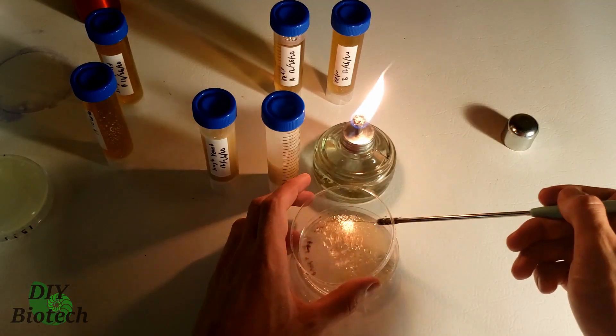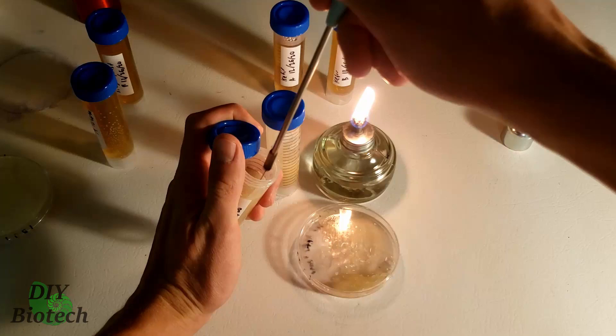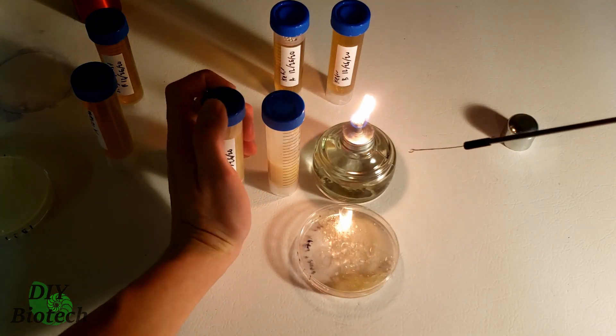Now that I had the isolated yeast, I concocted a mixture of sugar, flour, and water and touched one of the yeast colonies into it to inoculate the mixture. When I make homebrew kefir, the yeast grows in brown sugar and water, so that's what it's used to — and flour is what I'm trying to transition it to grow in. As I often mention, genes in organisms act like toggle or dimmer switches, so it's a good idea to slowly transition your organisms to a new environment for best growth results.